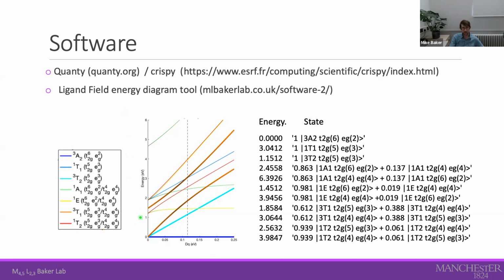While the Tanabe-Sugano diagrams are useful, I think if you're wanting to compare to experiment, it can be better to be able to calculate your own as a function of dq or as a function of beta, and be able to take cuts to actually infer directly what the electron occupation is of the individual states in order to determine whether they're transition allowed for the pre-edge or the 2p3d RIXS.